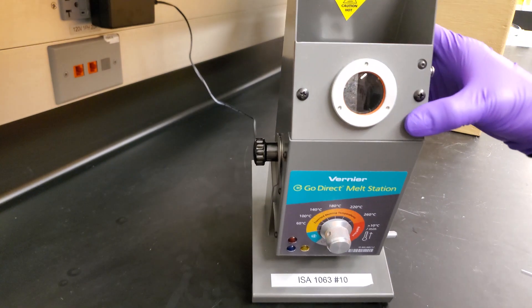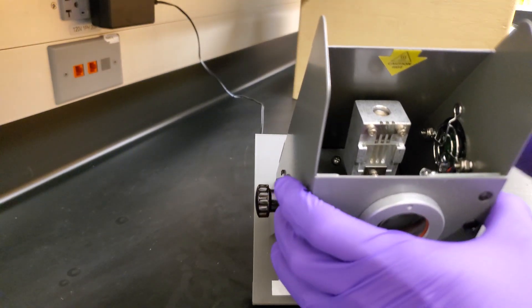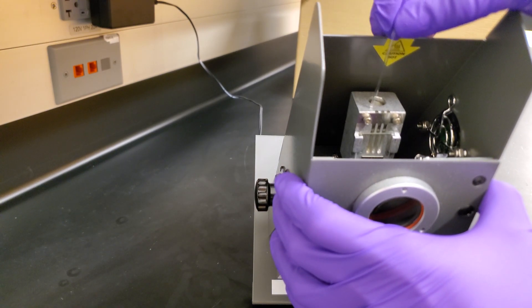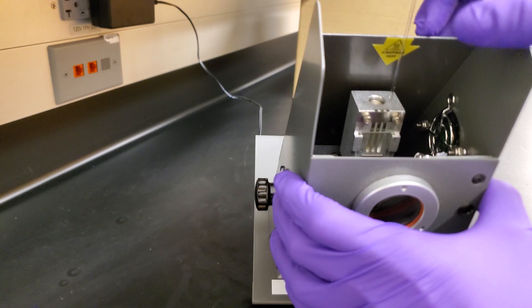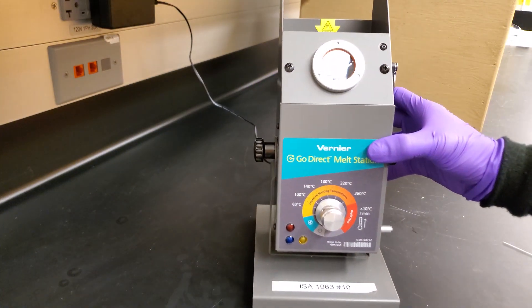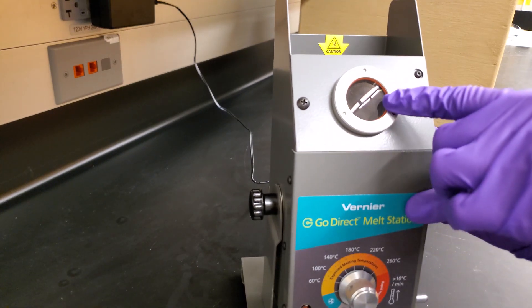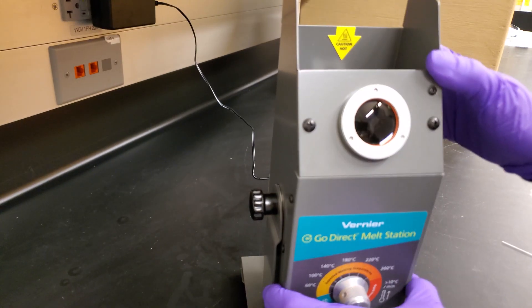The melting point comes with three slots for capillary tubes, which you're able to load by following one, two, or three. Multiple samples can be put in at the same time. You also have an observation window, which allows you to view your sample as it's melting. This does tilt, allowing for comfortable viewing.